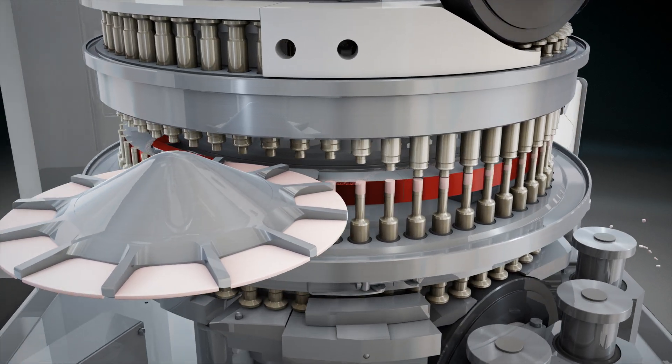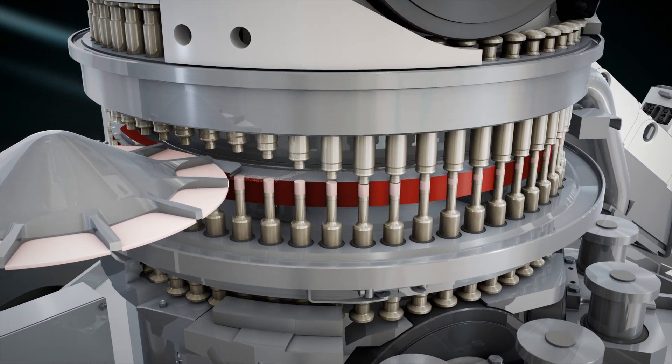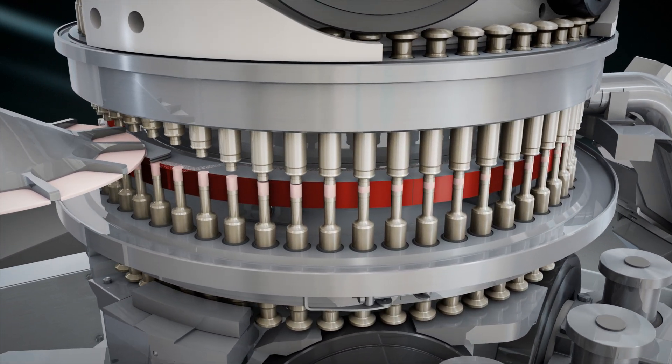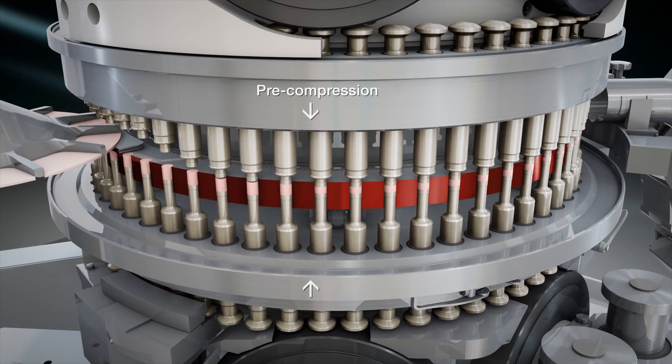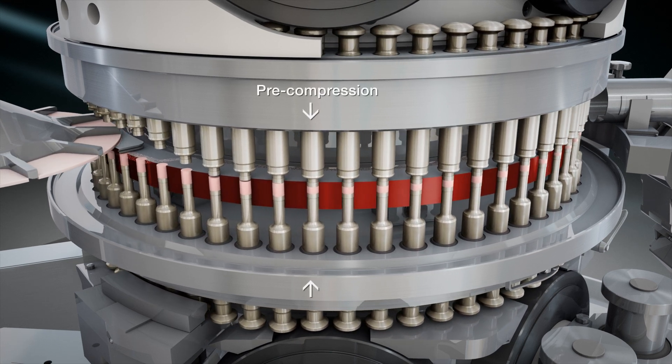After the dosing, the material is pre-compressed. At the pre-compression station, the upper and lower punches move together and vent the air from the material.